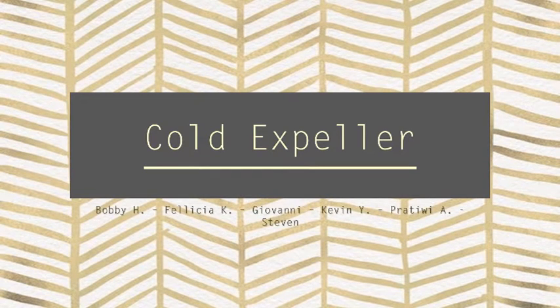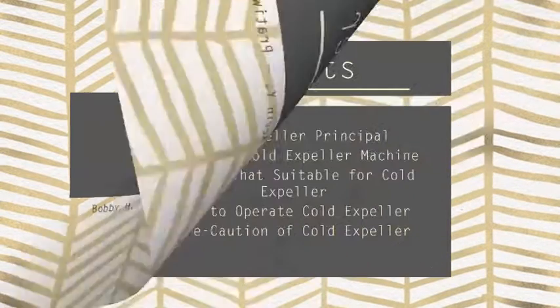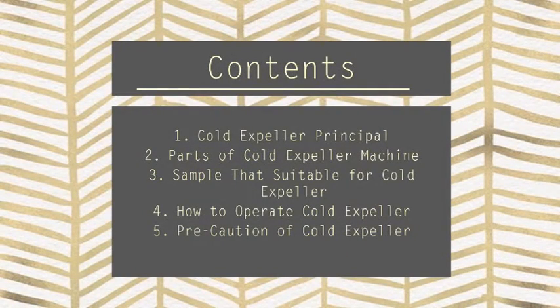Today, we would like to tell you about cold expeller. Our topics today are related with the principle of cold expeller, parts of cold expeller machine, sample that is suitable for using cold expeller, how to operate the machine, and last but not least, the precaution of using cold expeller. So, what are you waiting for? Let's go!